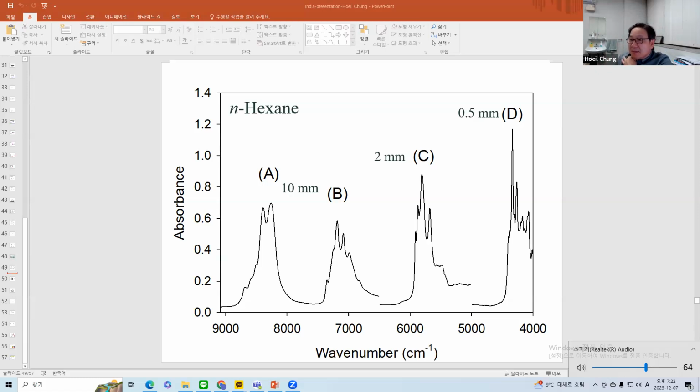Okay. And right now, you are saying the basic PLS, right? Now there are many variants of PLS also available, but the basic PLS still works good. Yes.